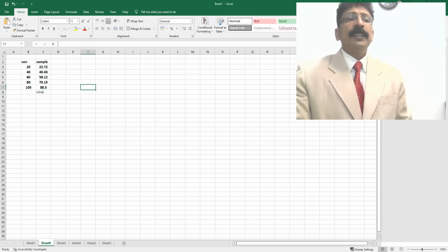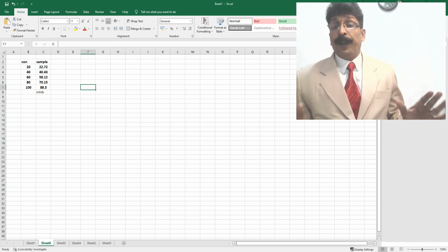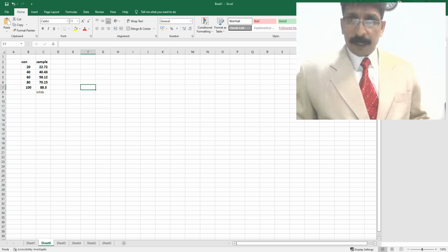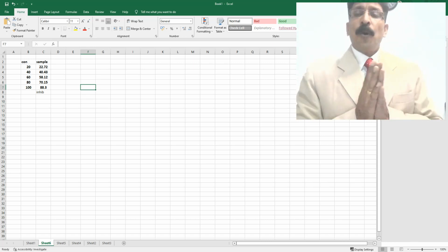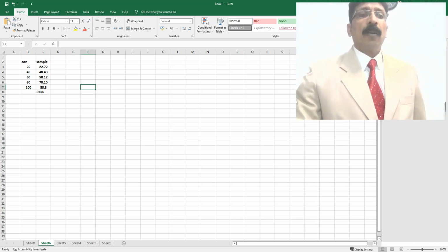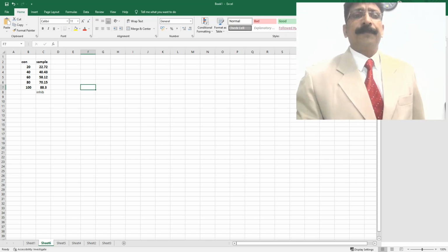So these are the two readings which we have got, and we want to find out the IC50 for our experiment. So it's very simple for you to do. What you have to do, Excel, plain sheet, and the concentration, sample reading. Even for standard also you can do the same thing.